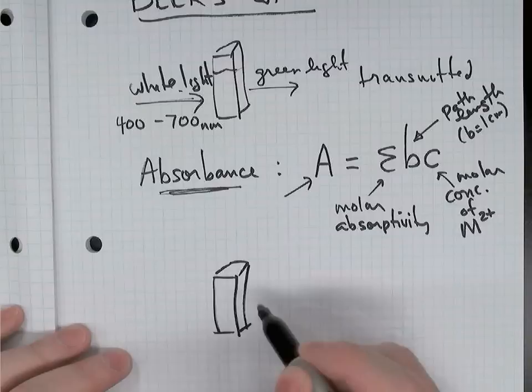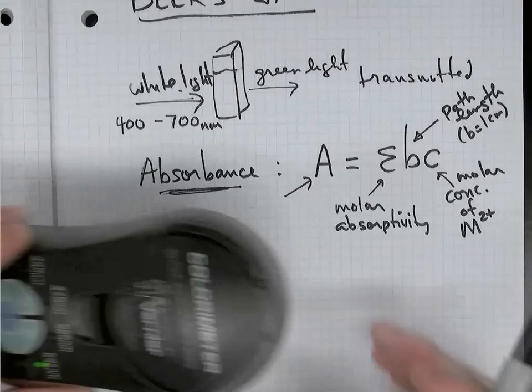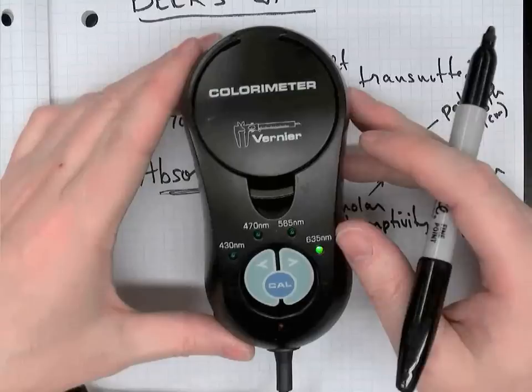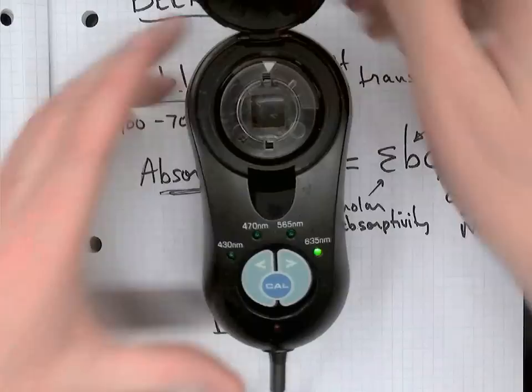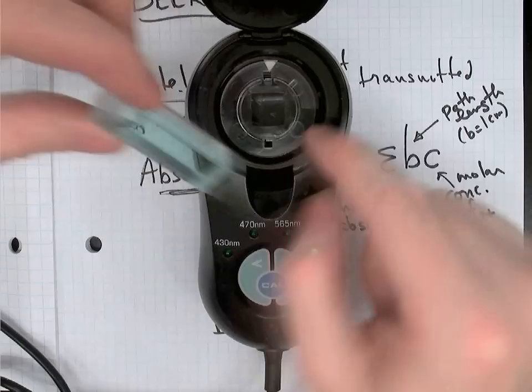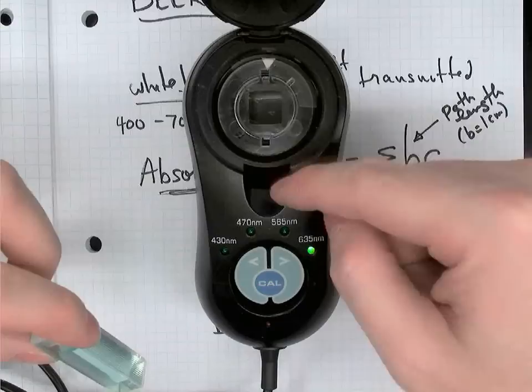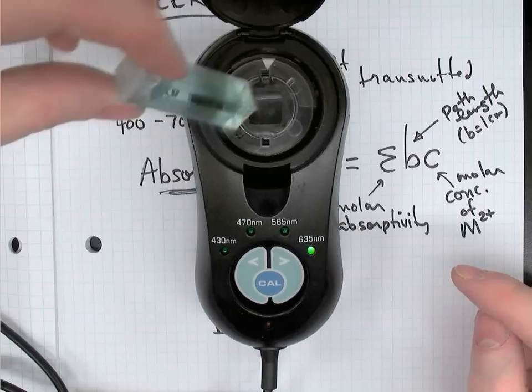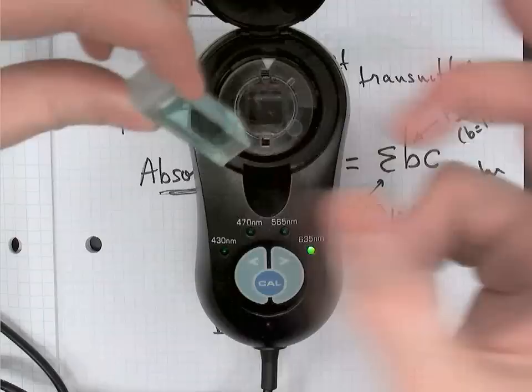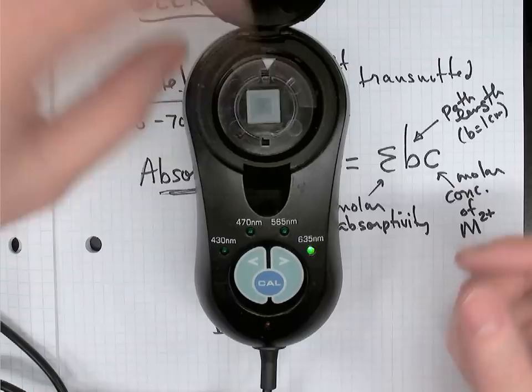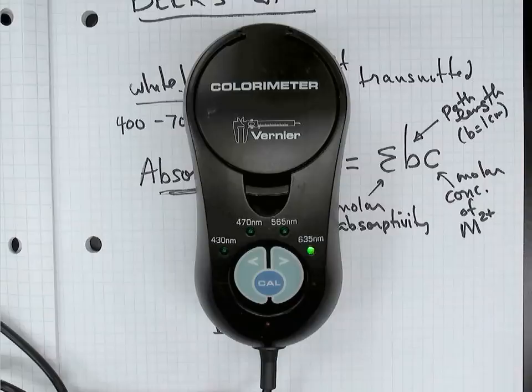Absorbance has a more rigorous definition. We're going to use something called a colorimeter, which has four different wavelengths of light that you can shine through a solution. You open up the lid, drop the cuvette in so that the ridged sides you can touch are left and right, and the clear sides where light travels through are aligned with the direction of the white arrow. I've dried the cuvette with a tissue, removed any air bubbles, and ensured there are no fingerprints before dropping it in and closing the lid to prevent outside light from entering.